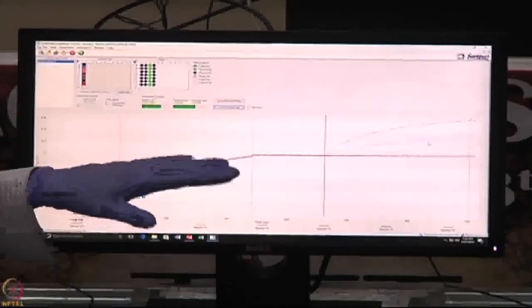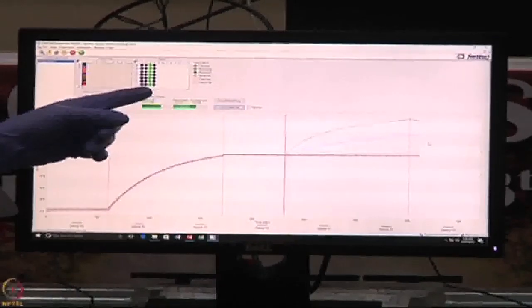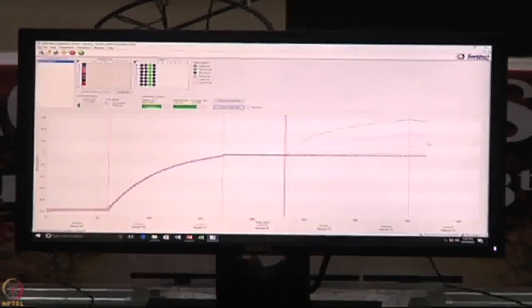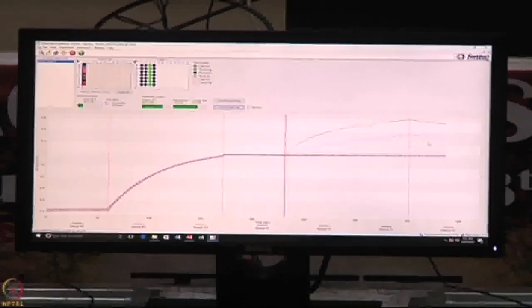When you're working with concentrations like in kinetics experiments, we go with the, so now it moves back to the dissociation step. You can observe the bound molecule start dissociating. So I'm doing around 180 seconds. Generally, with either SPR or BLI technologies, for the dissociation rate, 5 to 10% dissociation is good enough to calculate the KD value.